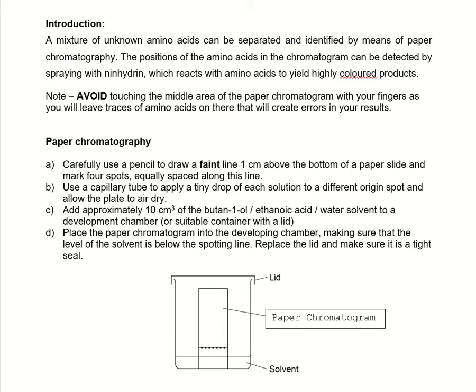So the solvent is the mobile phase. It will drag up the chemicals at different speeds depending upon their interaction with it. Remember to record where it finishes. A lot of students forget that. You should record the end line where the solvent gets up to.